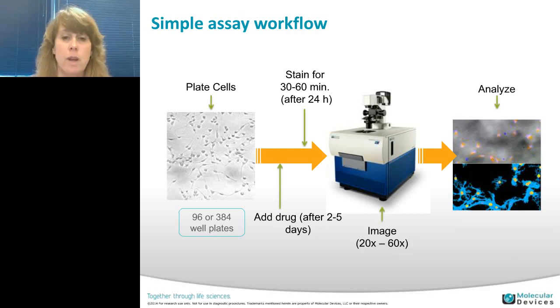Then the cells were imaged while alive on the ImageXpress Micro. And generally, I was using data from my 40x objective for generating my curves, and I also took 60x images. And then these were analyzed with MetaXpress software, and that data was collected and further analyzed in AcuityXpress.